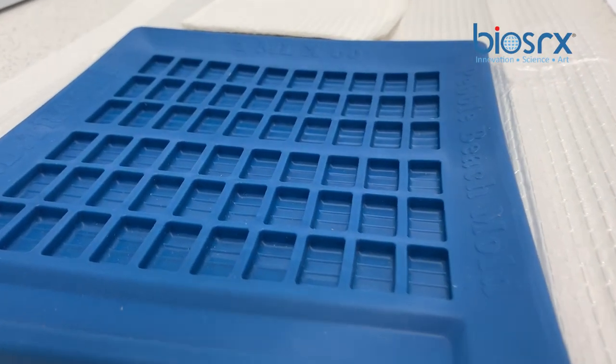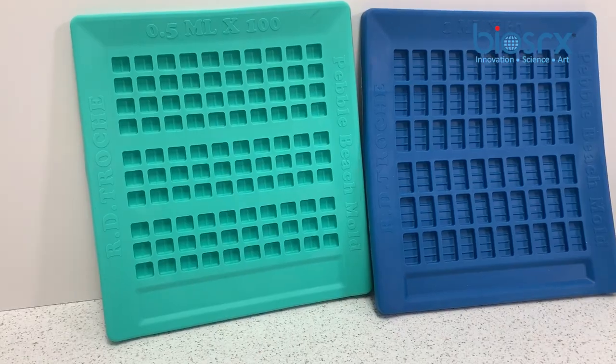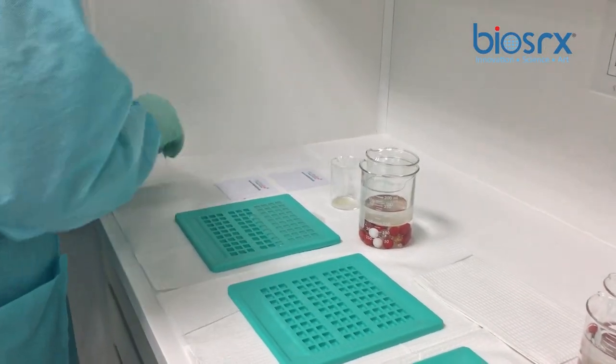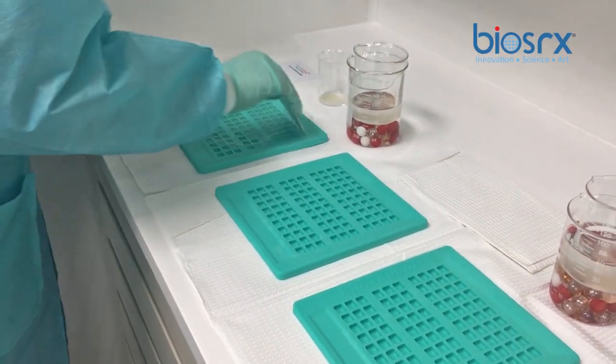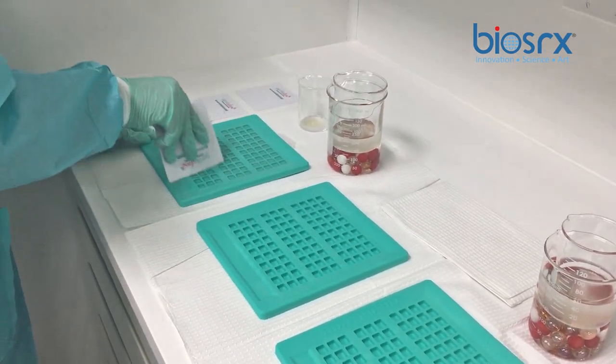This property allows us to compound medications of up to 250 degrees Fahrenheit, something other trochee molds cannot do. Because of the high heat resistance and design of the segmented cavities, these trochee molds allow us to make 30, 60, or even 100 trochees at a time.